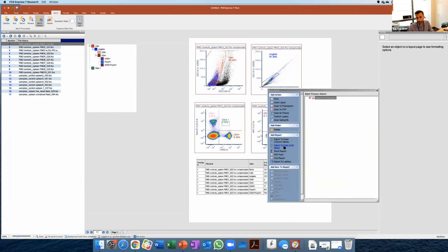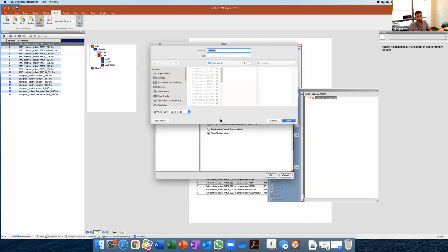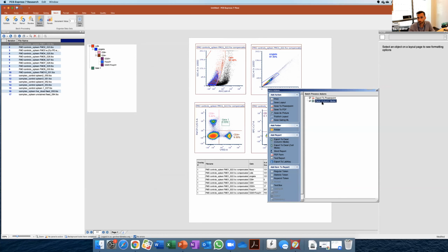So in this case, we would add a report, and let's call it just report, that will be enough. And we'll try to see if it opens because it wasn't working for me. And so, oops. So we have a report.